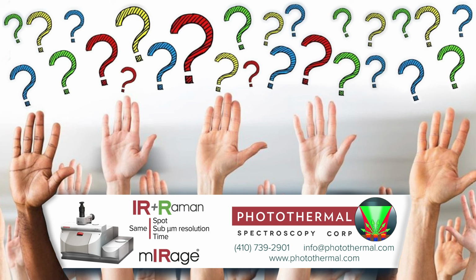We trained the models ourselves by cultivating the bacteria in different conditions, and in a similar way, the cell-to-cell variability needs to be considered in these classification models. Therefore, I put a question mark on whether the transferability of the FTIR libraries for bacteria is possible. So the effect of the cell-to-cell variation needs to be studied in more detail.